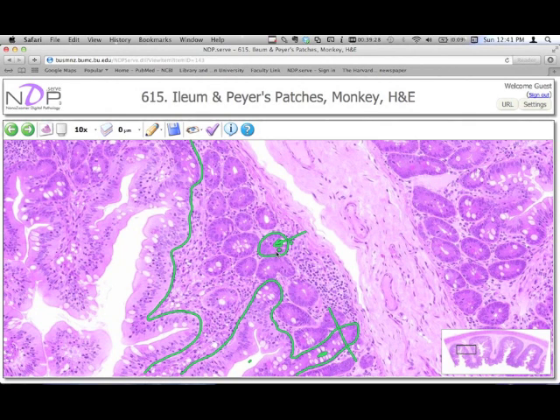And so these little circular profiles are finger-like invaginations of the epithelial sheet. And here's the lumen here that, for instance, may connect out of the plane of section with the lumen there. And so these profiles are actually part of the epithelium, but we just don't see the connection.